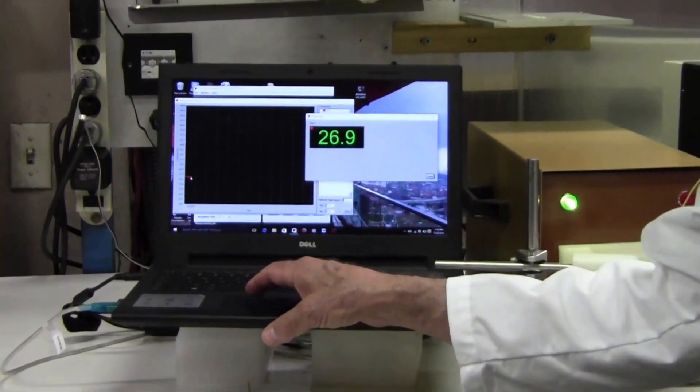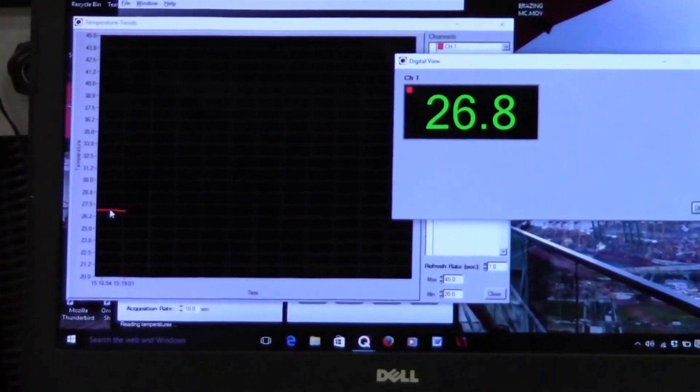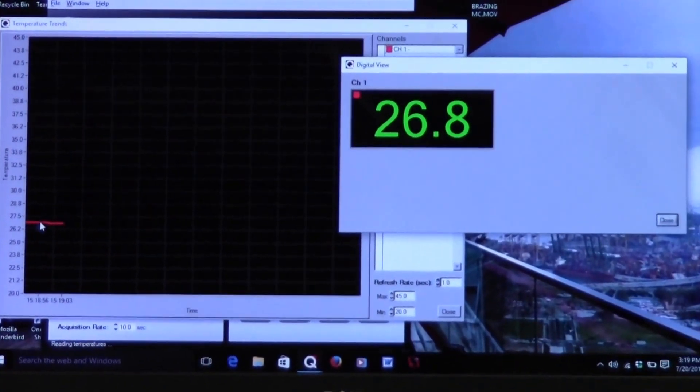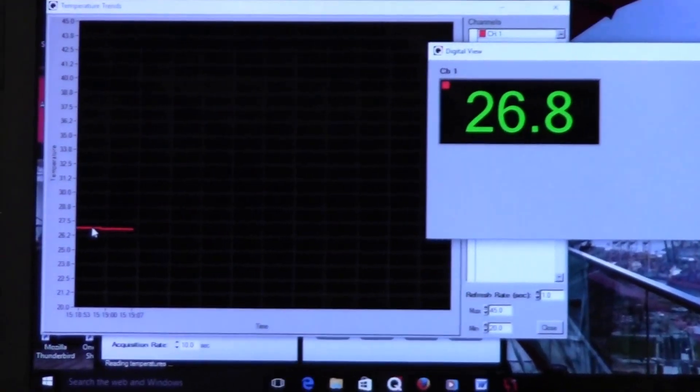All right, so here we are. That's our starting temperature. We're in temperature control, and I'm going to go ahead and press the foot switch right now.